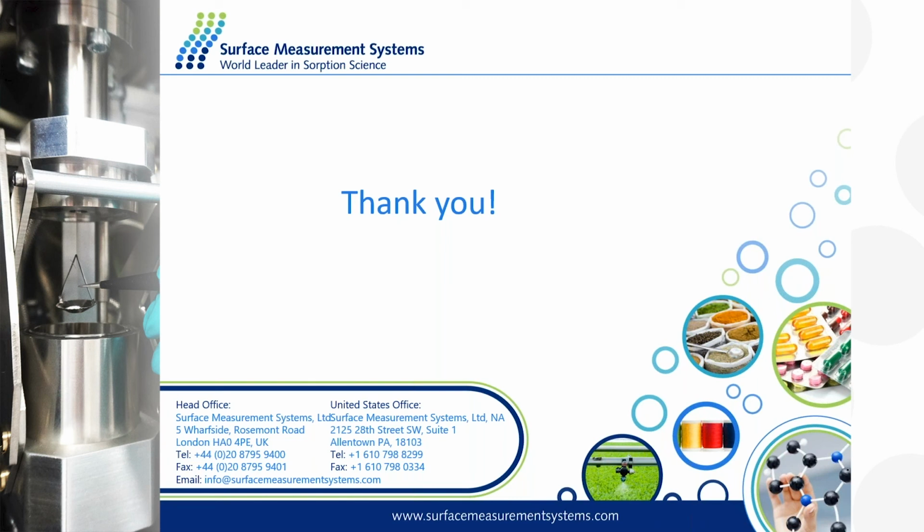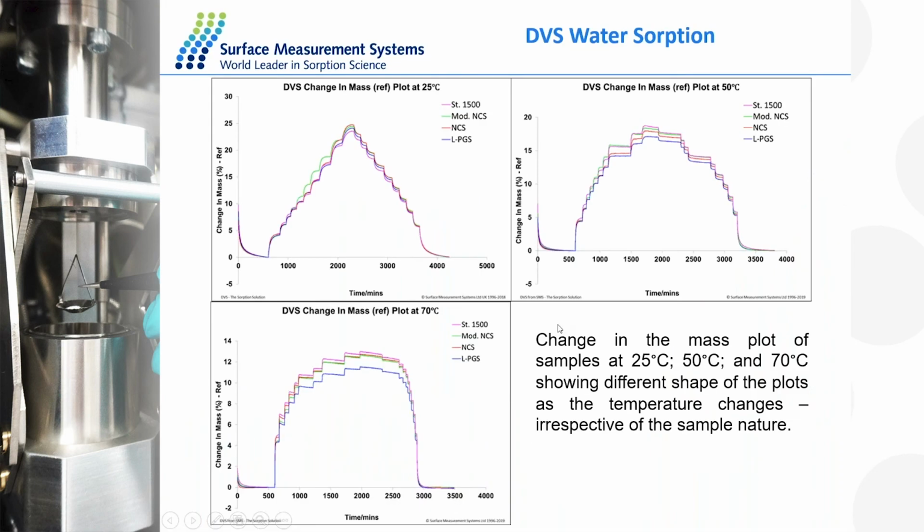Thank you for your presentation. According to the last slide, the temperature was a more important factor than the type of material, since the graphs were almost identical in each temperature category. So what about the RH percentage? Does higher RH cause any effect, like saturation, in affecting the sorption isotherm? What about the rate of introducing RH to the material?